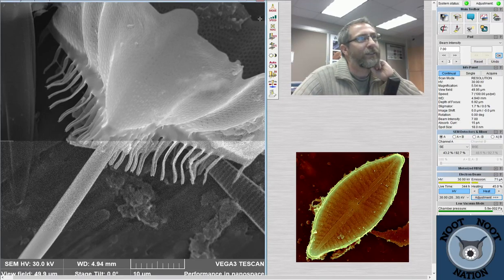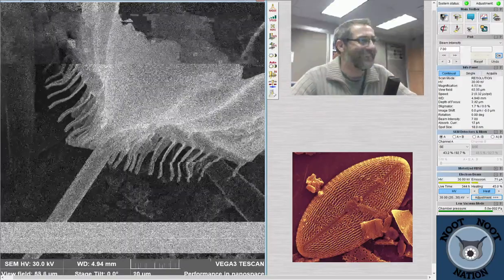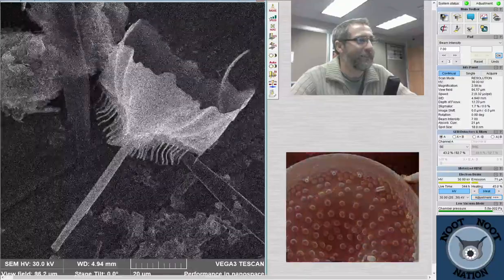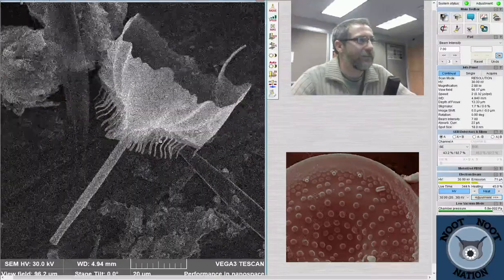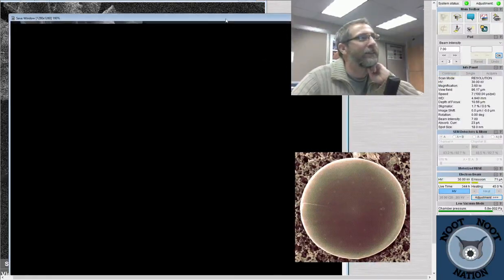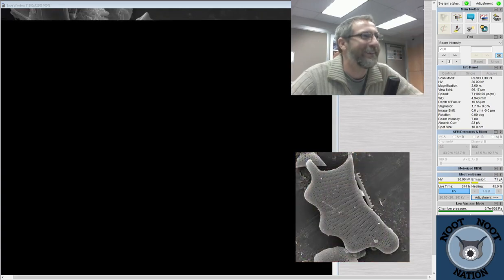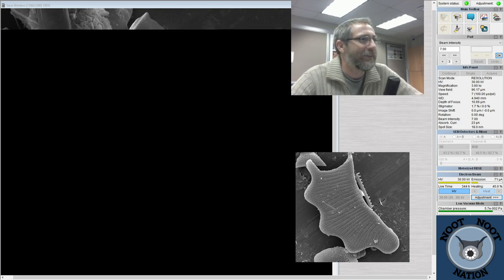And I'm going to jump over and answer questions. I just wanted to start this by taking a photo, and I wanted to make sure that the photo was going to look okay. So I'm just going to zoom out a little bit. I think it's in focus. It's fighting me a little bit with where I should align it. And then I'm going to snap that photo. It takes a while to draw the photo, and I can usually use that time to catch up with everybody. Yeah, it's Ditylum. Sorry, I forgot to mention the name, Ditylum.